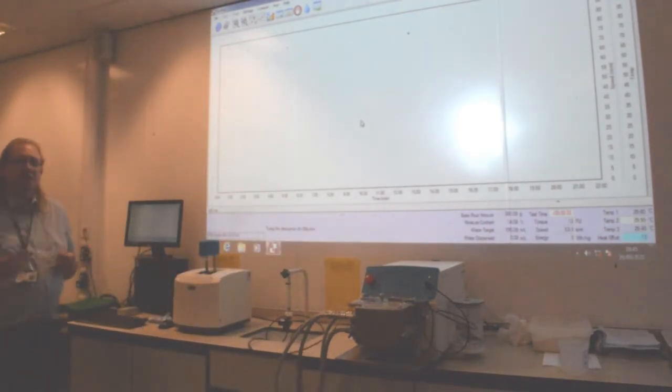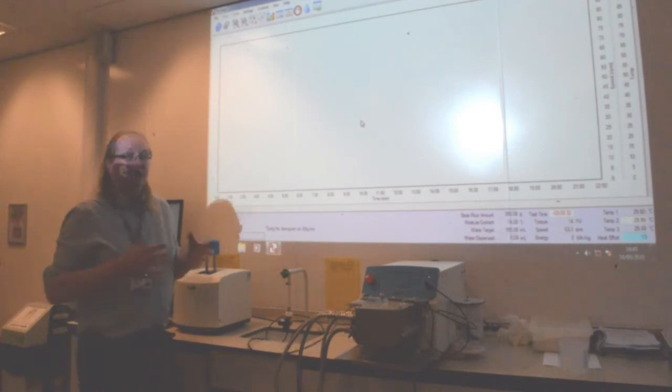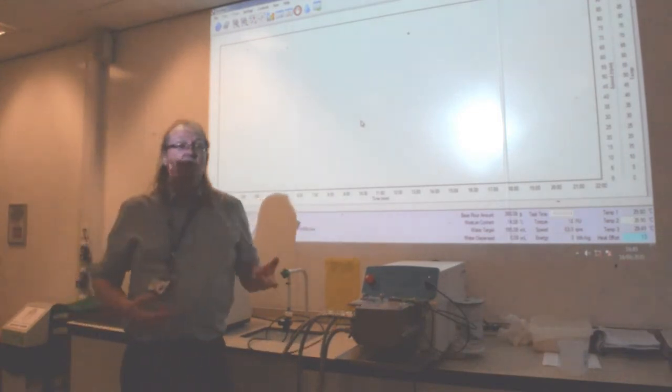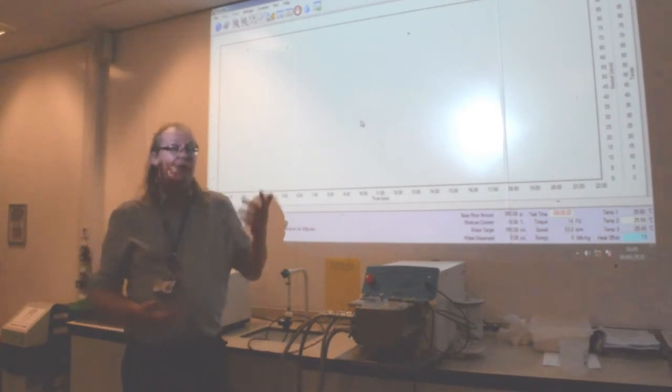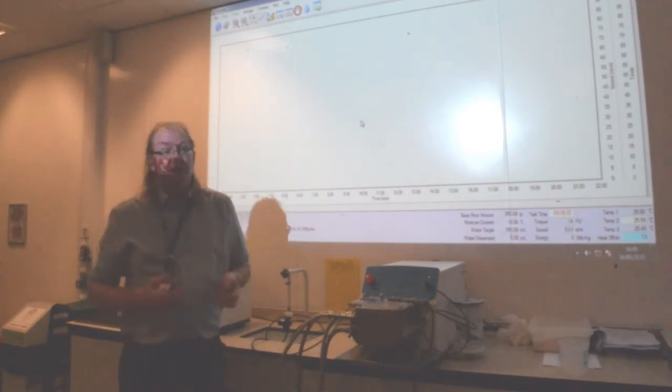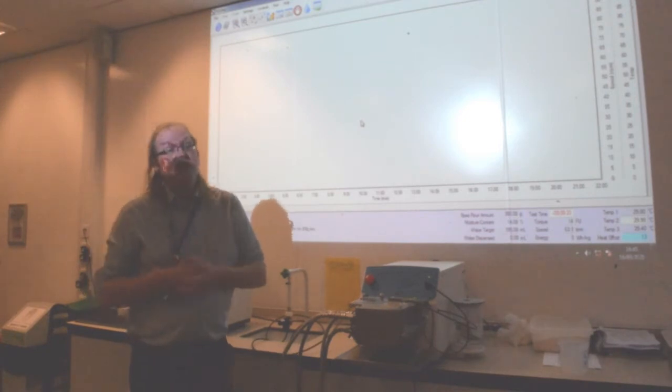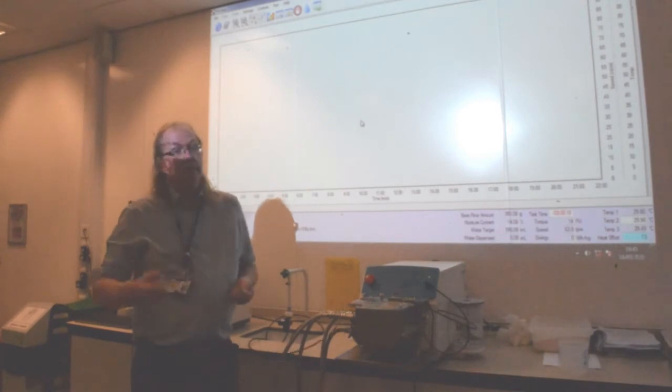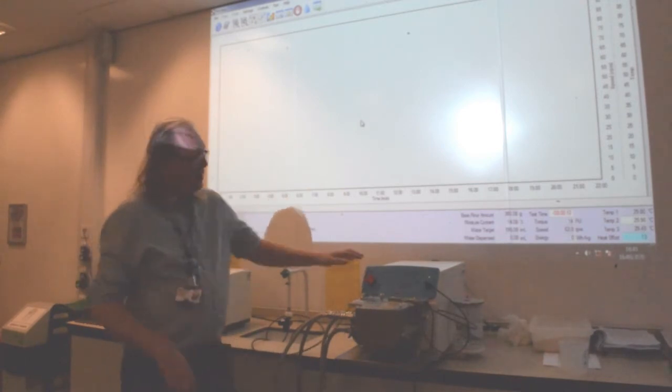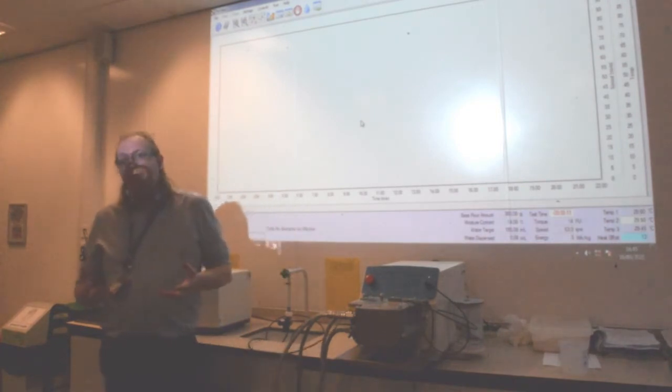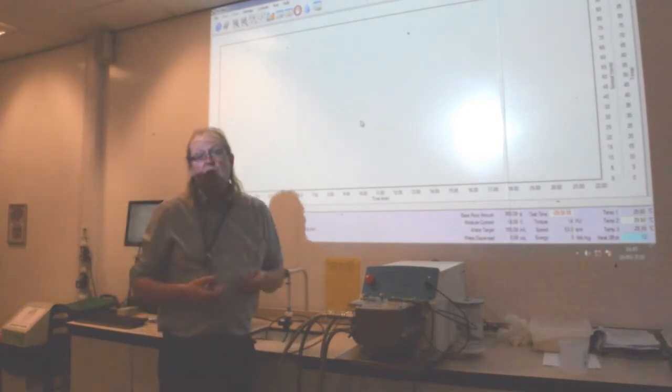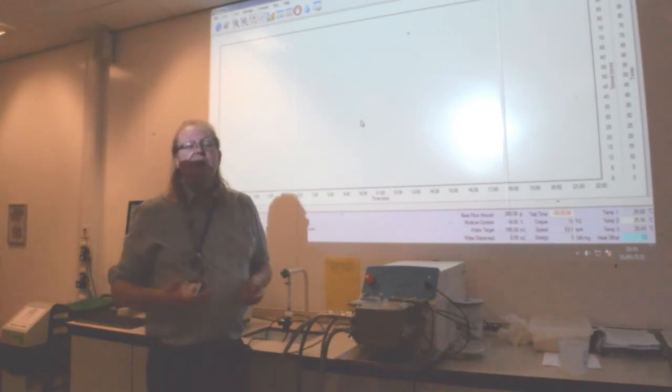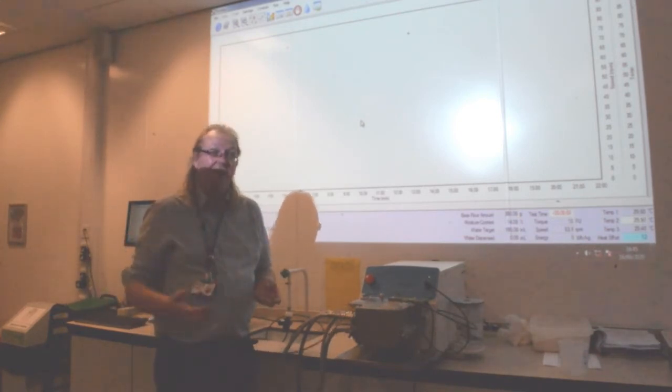This test is going to take approximately 20 to 25 minutes in total. Then the machine will need to be washed up before it can be used again. So you're basically talking about one test every 30 to 40 minutes, which is quite slow, but it's a very accurate test. In the flour mills where these machines are used, they quite often do five or six, seven, eight tests per day.